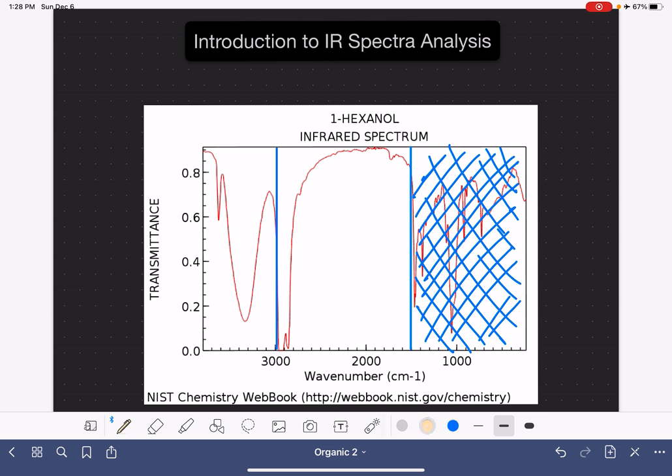This part of the spectrum we refer to as the fingerprint region. It is due to the stretching and bending of single bonds, and our molecules have tons and tons of single bonds. That means that this part of the spectrum is going to have a lot of peaks in it. As you can see, this one had a lot of peaks in it, and it's usually not useful for us to attempt to understand and analyze every single one of those peaks.